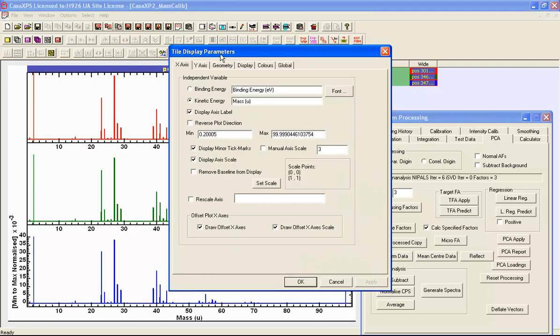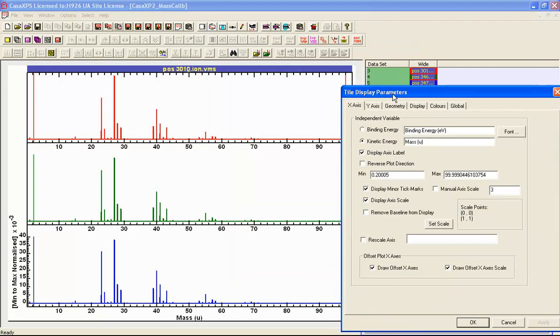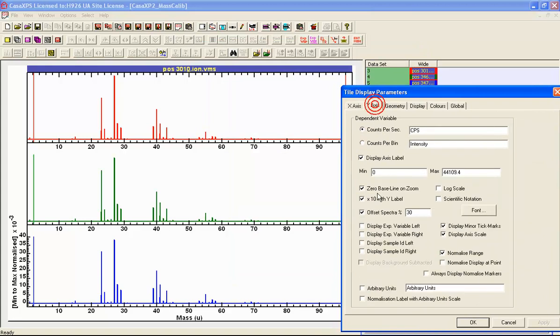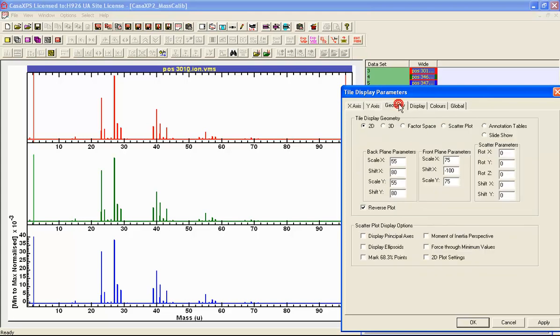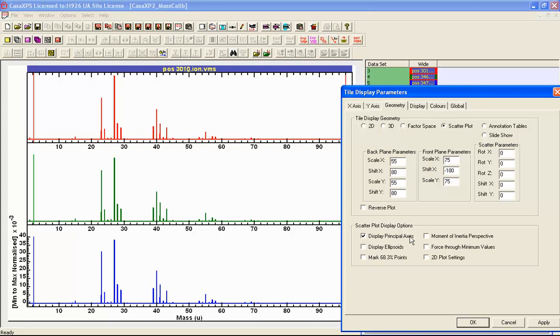To see this three-dimensional cube we'll use some options on the tile display parameters dialog window and adjust the display so that we have no offset, set the range to be 90 percent rather than 30 percent, we'll take off normalization, and on the geometry property page we'll select scatter plot. We won't reverse the plot, and we will select the display of principal axes. Now the principal axes are directions in the three-dimensional plot that are related to the abstract factors, so this display is quite useful in understanding what happens when a principal component analysis is performed.